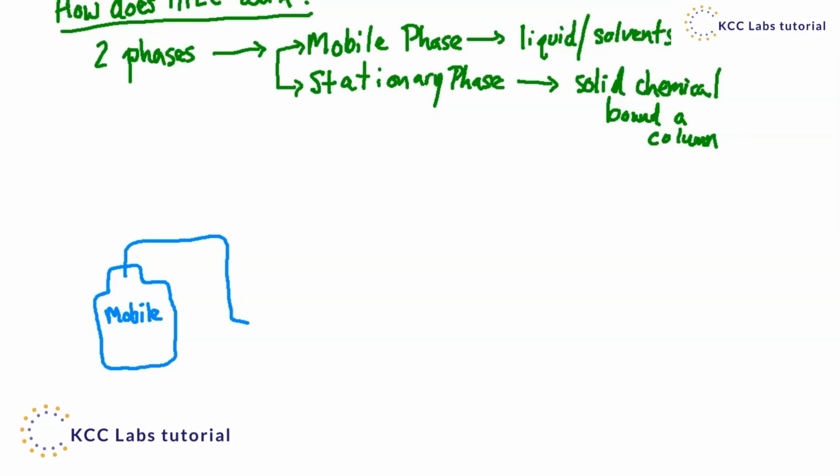And in the stationary phase, as we described, it's going to travel along and separate out at different times. And once it comes off of the column, it's going to hit the detector. So the detector is usually going to be UV-vis, and you can use a fluorometry type of detector where you're doing fluorescence, if you have the proper derivatives and materials.